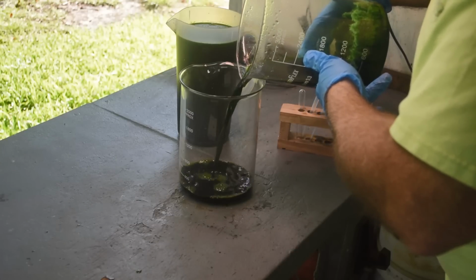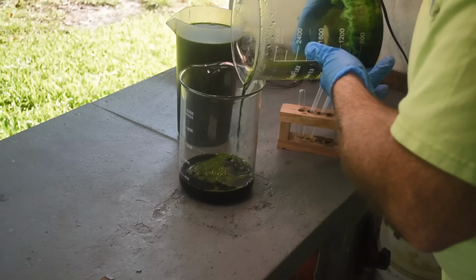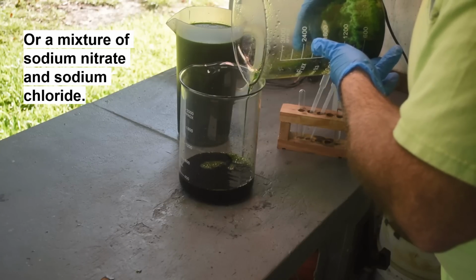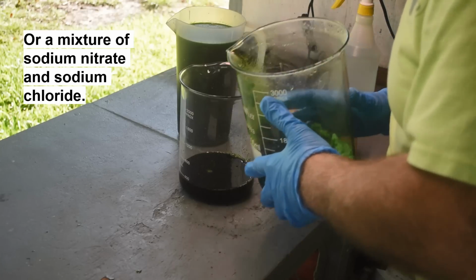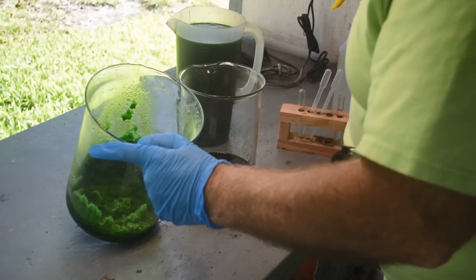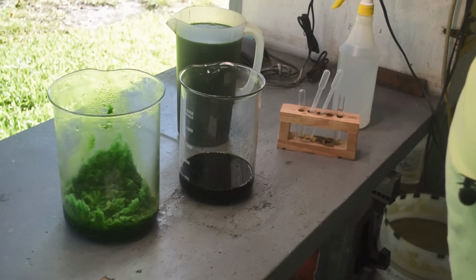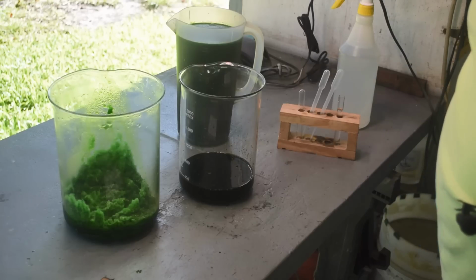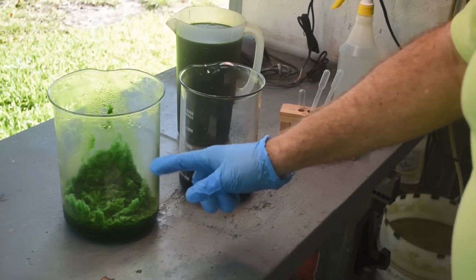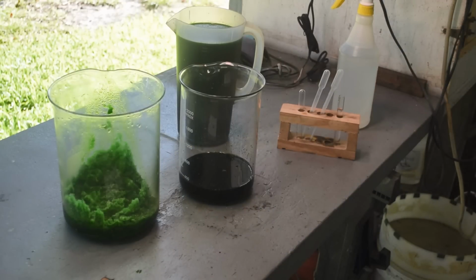So I'm pretty certain that most of this solid in here is excess sodium nitrate that I used. My poor man's aqua. That was my big mistake, I'm pretty sure. So we want to leave that behind because I want to denox this stuff. So I've got an idea. I'm going to try washing some of this stuff with some cold hydrochloric acid and see if I can get some more palladium out of it without dissolving a lot of the solids in here. So let me try that.